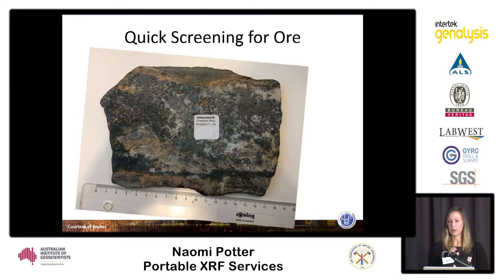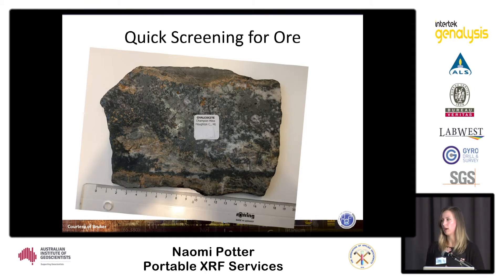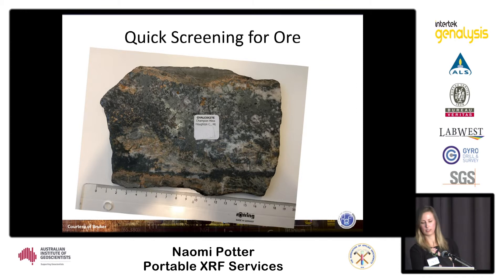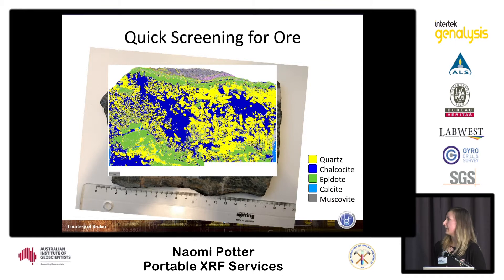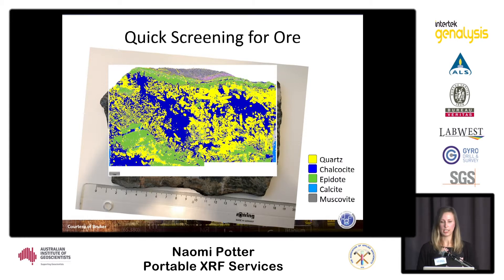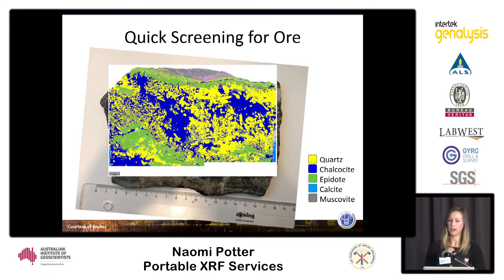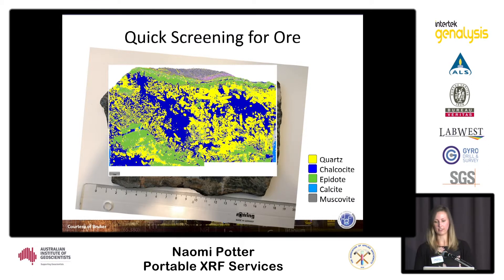The last example was done for quick screening of ore. This is from Champion Mine in the USA, and they were looking at chalcocite. As you can see, you can easily identify it, see its textural association with other mineral phases, and they were able to identify additional minerals such as calcite and muscovite.